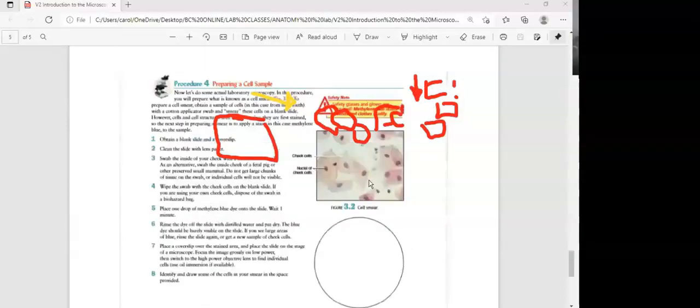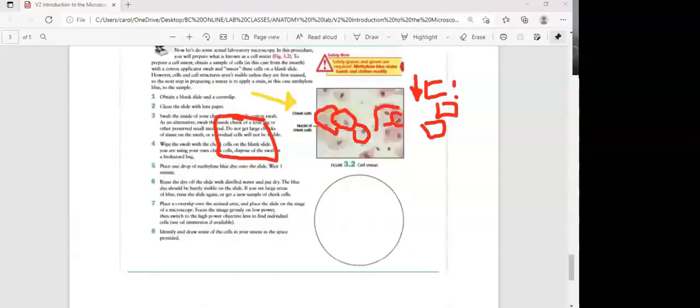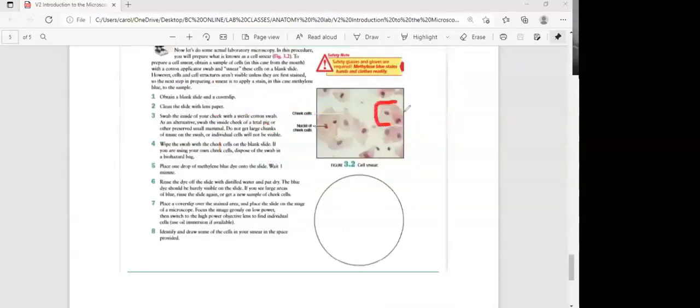If you look over here, then you can see that this is down here, right? And this one is darker, right? Why is it darker? Because that one is in superposition of the other one, it is on top of the other one.